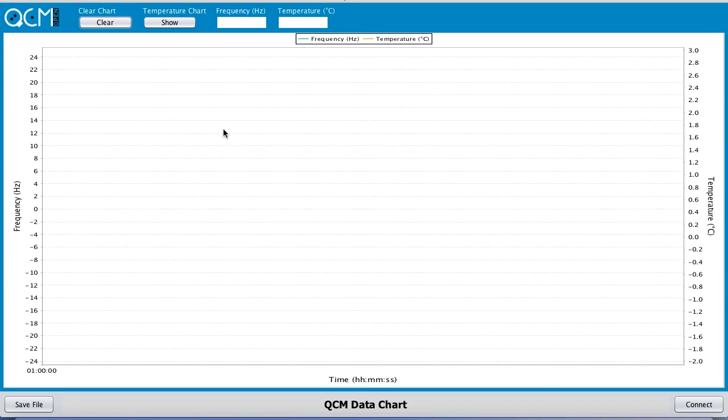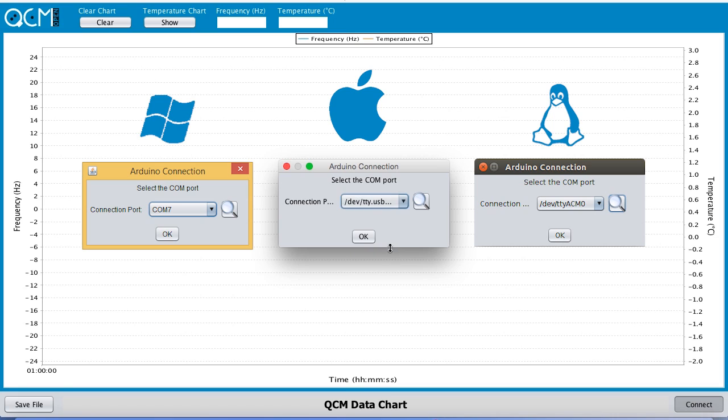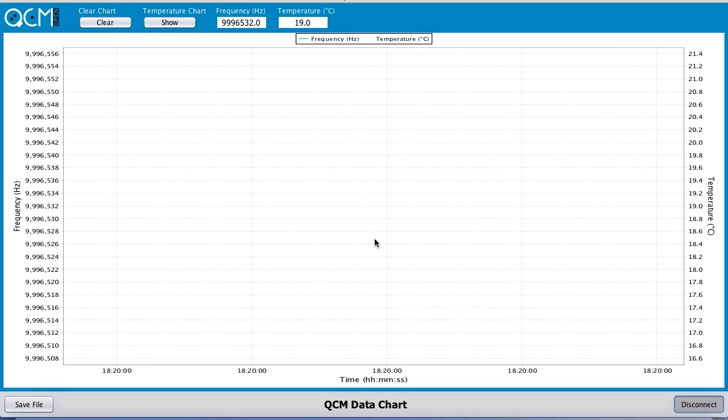Press the connect button. A pop-up window will be displayed. Find and select the correct COM port. The port name depends on your operating system. Press OK to connect OpenQCM.